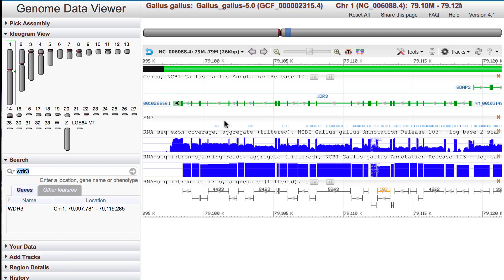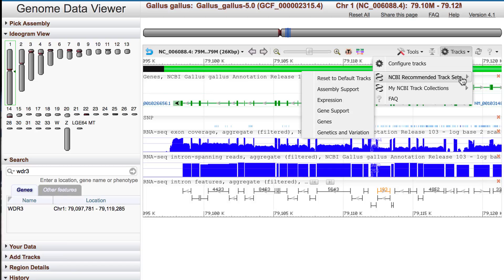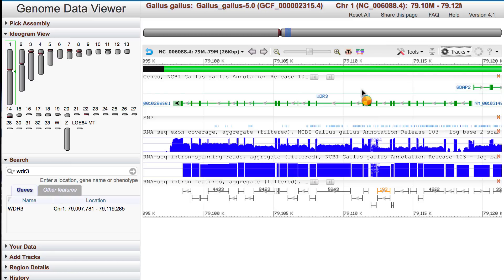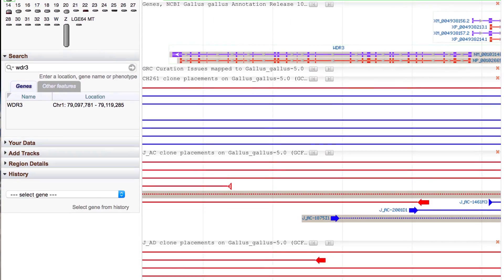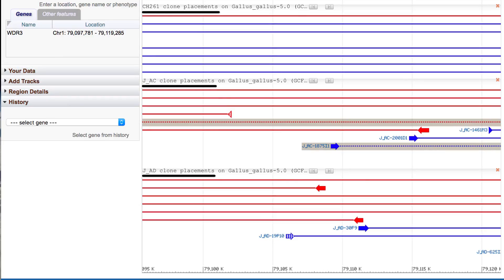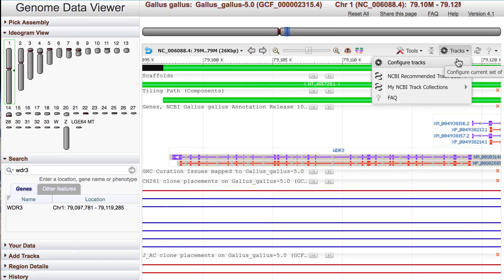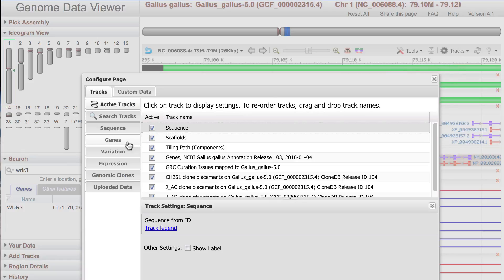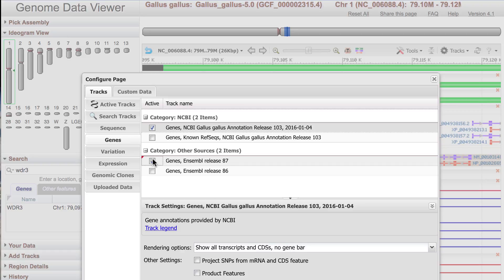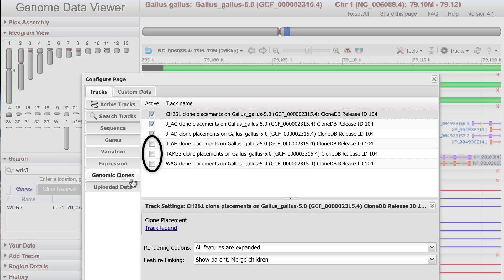The next step is to add tracks for clone placements. From the tracks menu, mouse over NCBI recommended track sets, then select Assembly Support. This adds a predefined group of tracks, including clone placements for the three libraries with the largest number of placements. We can add tracks using the Configure Tracks menu, so I'll add the Ensembl gene model. I'll go to Genes in the Configure menu and select Ensembl Release 87. I'll clean up the display by changing the rendering options for the gene tracks to GeneBar only. You could also add other clone placement tracks in the Genomic Clones set. I'll go down and hit the Configure button.